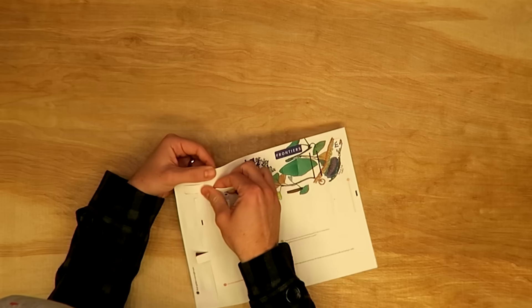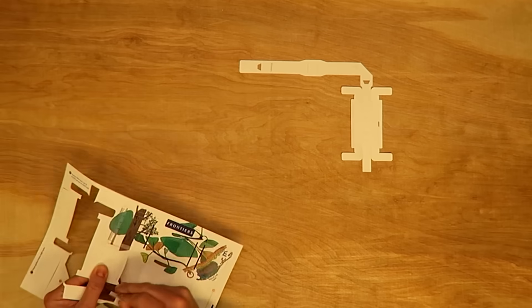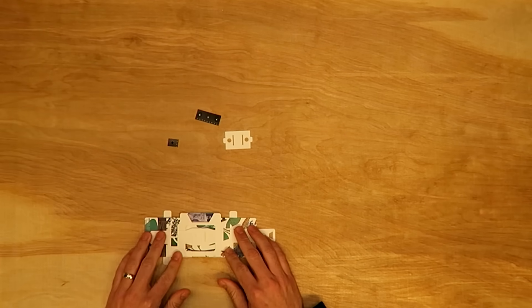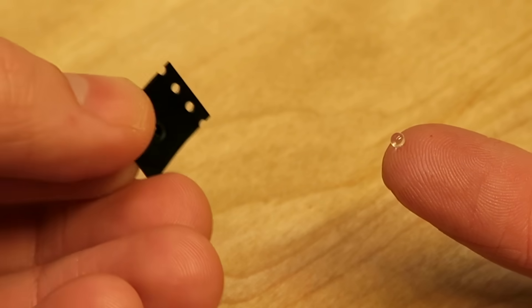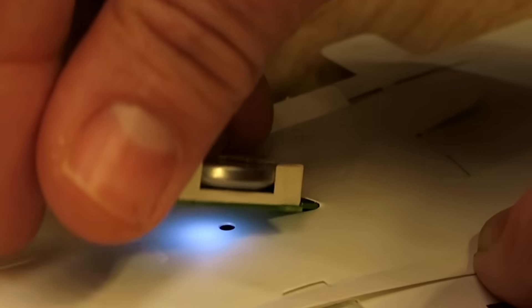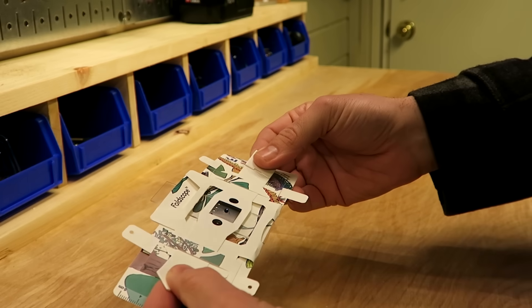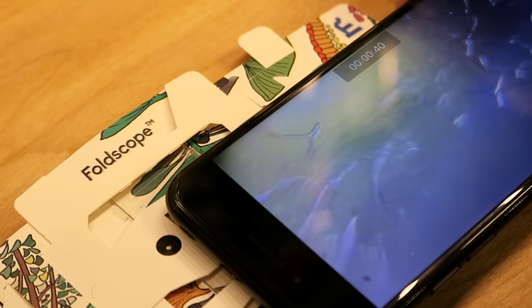Let me support that statement by showing you how this 50-cent paper microscope actually works. It comes like this, and then you pop out the pieces of paper, and then follow the simple instructions like folding origami. The lens is actually a tiny sphere of glass embedded in this plastic. You can put your slide in here, and then you look through that tiny glass sphere, and it's magnified 140 times. You can even put your phone up to it and film and capture video like this.